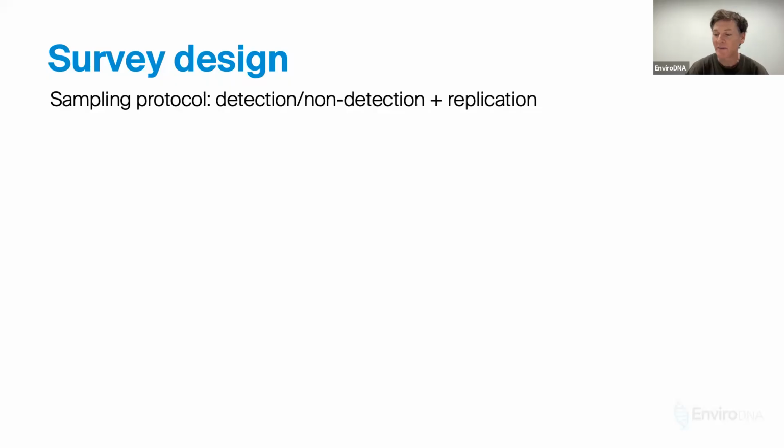It's not always relevant for snapshots, but the general aim for eDNA in a large-scale context is moving to a more probabilistic interpretation of the data, where you don't actually need to rely on any one observation critically, and if you do, then you probably shouldn't be doing just eDNA. You can compare that with other methods.